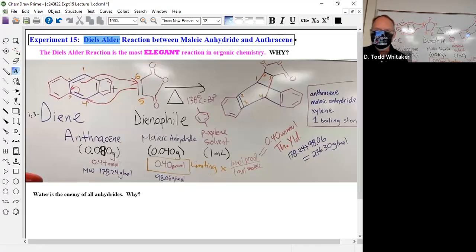So we're doing a Diels-Alder reaction. Diels-Alder, two German gentlemen, Otto Diels and Kurt Alder. We're doing it between maleic anhydride and anthracene.